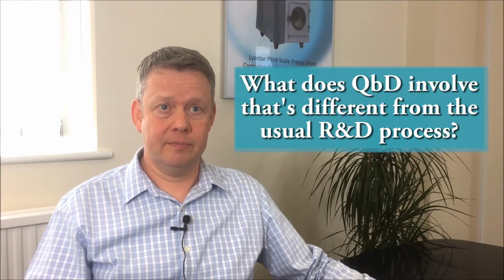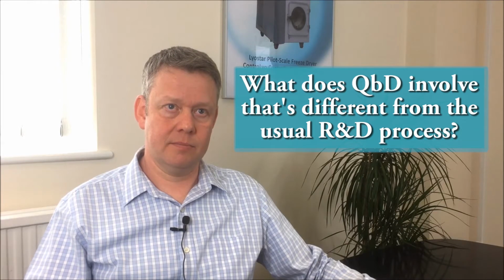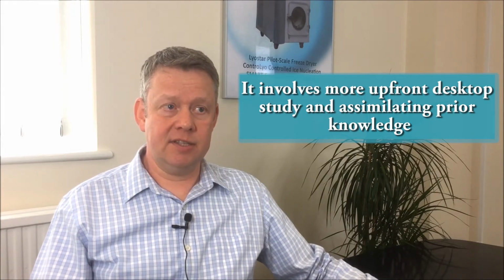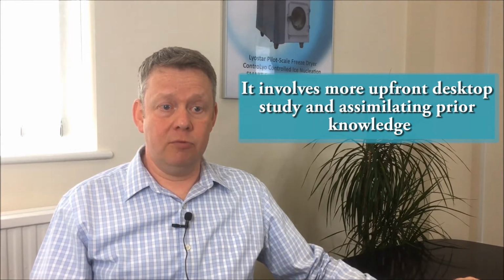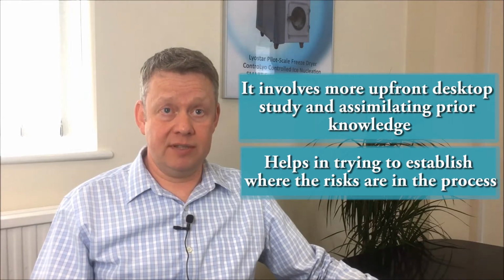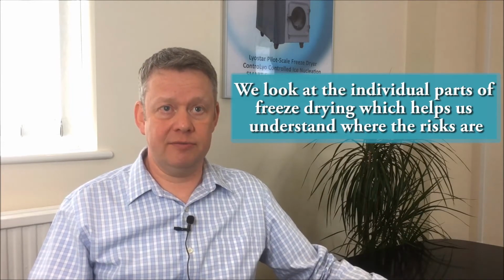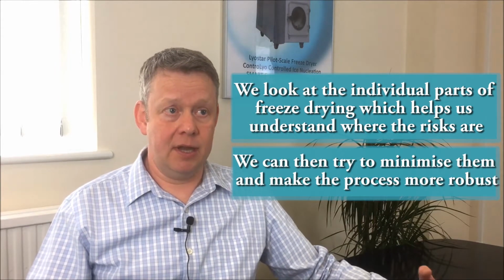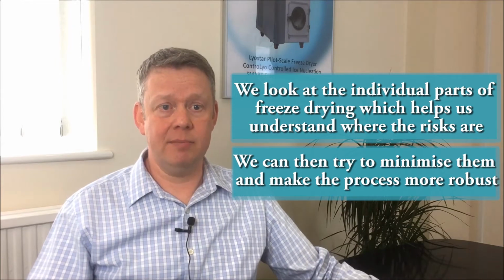Okay, and what does QbD involve that's different from the usual R&D process? Well, QbD involves, I think, more upfront desktop study and assimilating prior knowledge, rather than going straight into the lab, so that you can try to establish where the risks are in the process first. So it's a more structured process? It's a more structured process than the traditional iterative R&D process. So we then will look at the individual parts of freeze drying and understand where the risks are, so that we can then try to minimise them, and then hopefully also make the process more robust and minimise any scale-up issues.